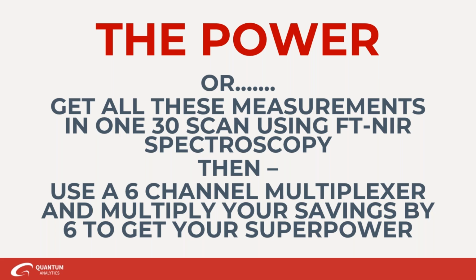When you're dealing with natural products and incorporating more sources of variability, then you want to continue to build on it as time goes by, especially with natural products, like adding harvests in subsequent years and that kind of stuff. So there's no magic formula. You just kind of know what you're doing. But the initial model building and taking a look at the statistics you have, that's definitely the first step, and then taking it from there.